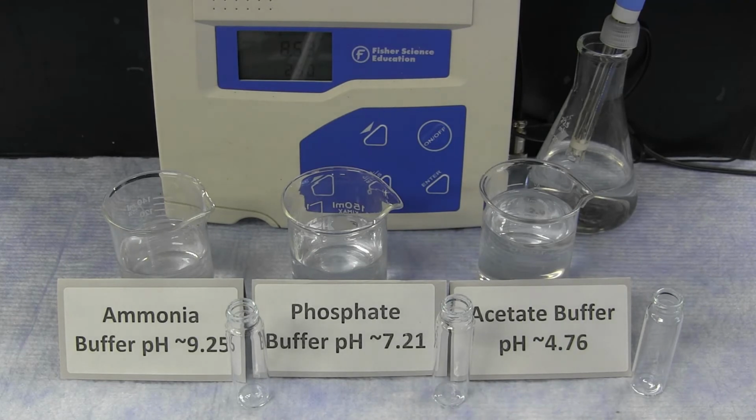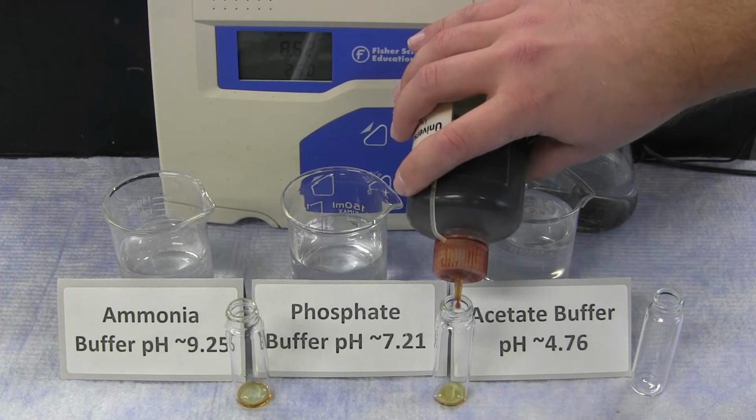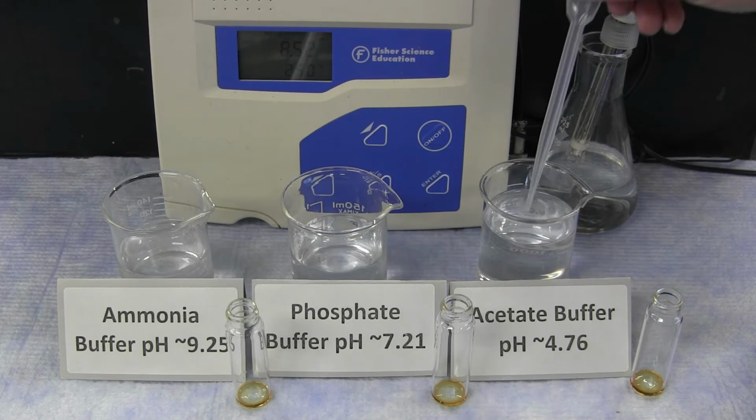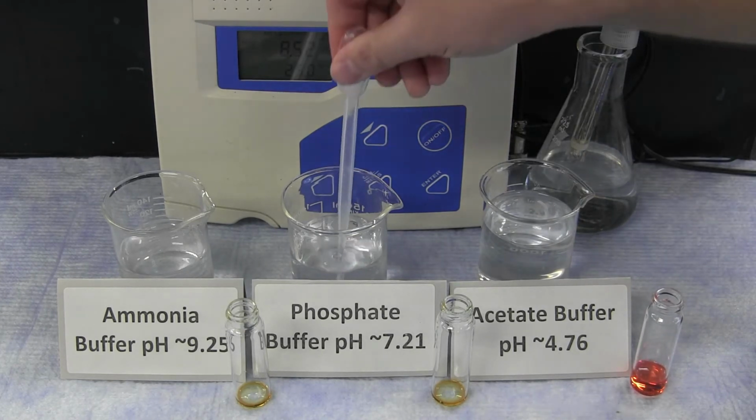The pH which the buffer hovers around is related to the pKa of the equilibrium reaction. The pKa value is the negative log of the acid dissociation constant, or the Ka, or in the case of ammonia, Kb. You can see with each of these different solutions that when universal indicator is added, the different buffers all create a different pH.